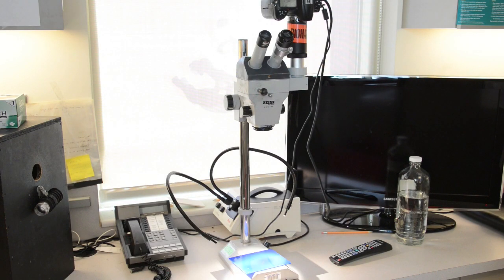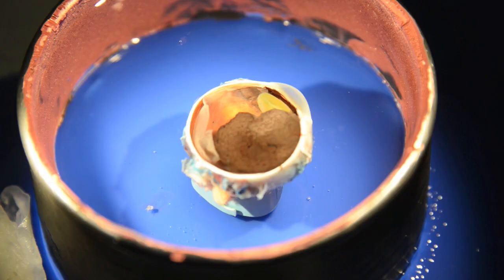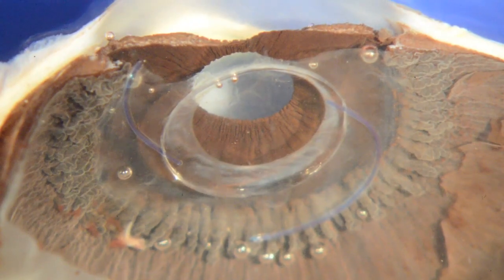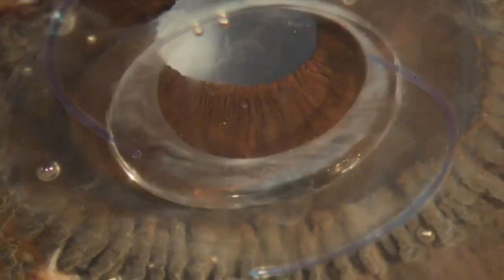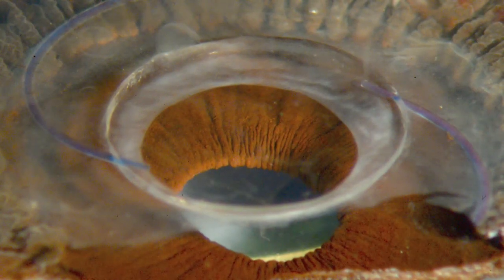After sectioning, the globe is examined carefully with a dissecting microscope. This eye contains a large, heavily pigmented ciliochoroidal melanoma. This eye contains a posterior chamber intraocular lens. The radial ridges on the iris pigment epithelium and the pigment ruff surrounding the pupil are seen through the optic of the intraocular lens, which is present in the lens capsular bag.